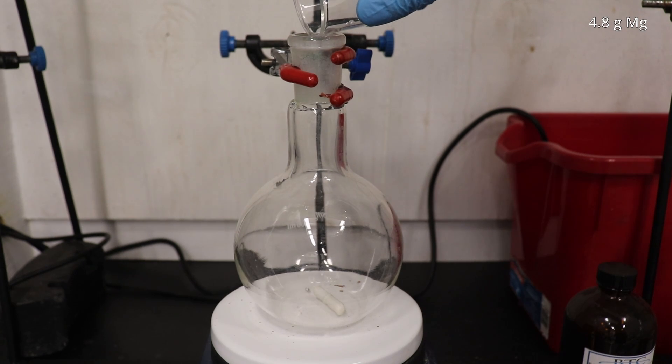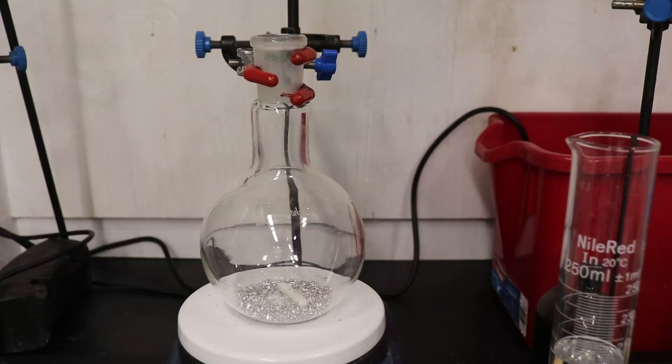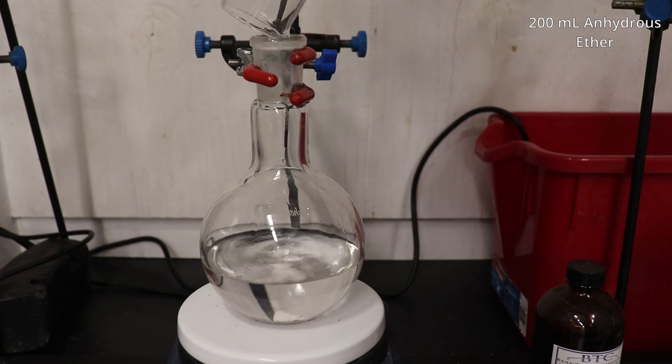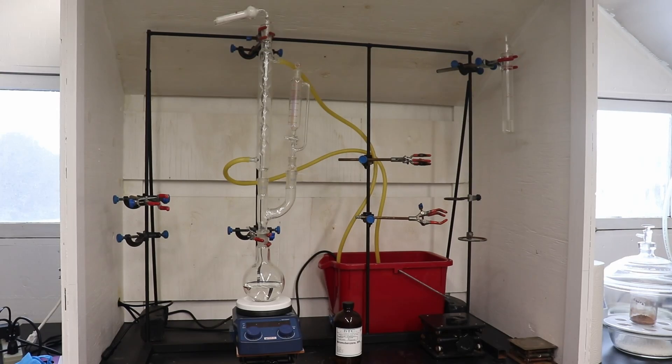To get started, we first have to prepare a phenyl magnesium bromide solution. So 4.8 grams of magnesium metal granules were added to a 500 milliliter flask. This was followed up by the addition of 200 mils of sodium dried diethyl ether.